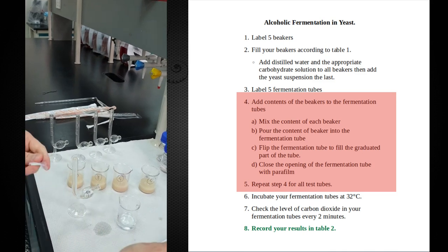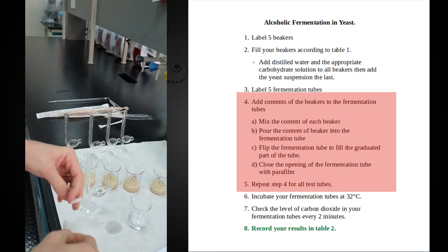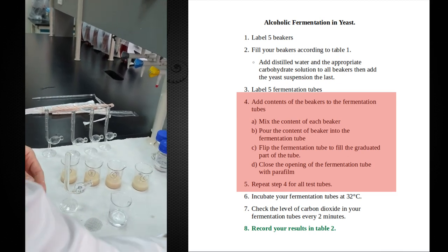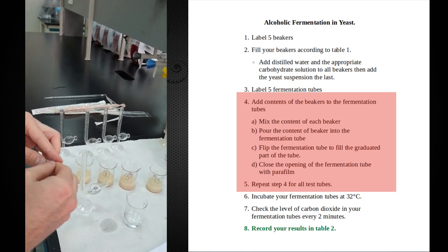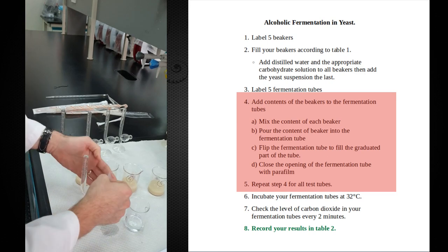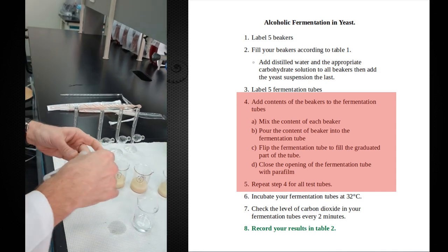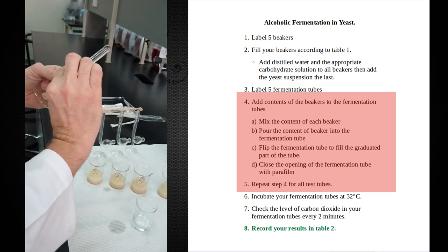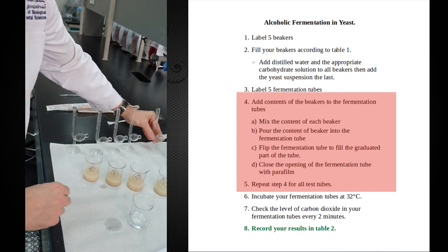I'm just going to take a small piece. The reason we're using parafilm is that we want to seal this off. Again, we're trying to look at fermentation. To study fermentation, we need to cut off oxygen supply. That's why we're going to seal this thing off. There's going to be initially a little bit of oxygen trapped in there, but that's going to get fairly quickly used up. At some point these cells are going to be stuck, and they're going to have to start using fermentation to be able to get their energy. I'm going to make sure that we seal this fairly tightly because there's going to be a bit of pressure potentially building up in here. Probably not in this tube, but in the others. So that's one.